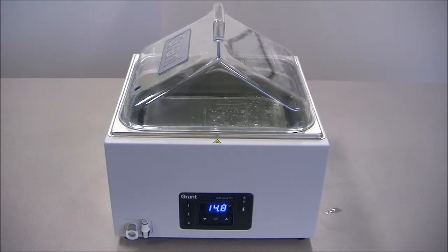This model is the SubAqua Pro. Again featuring a stainless steel tank, but available in a range between 2 and 34 litres. It also heats to a slightly warmer 99 degrees C. All models feature a PID controller and built-in drain tap, and the polycarbonate lid is included in the price.